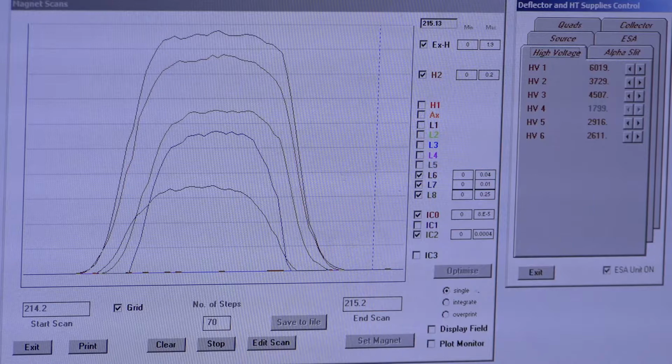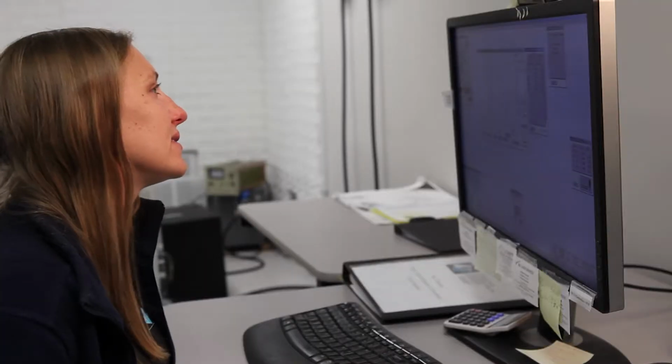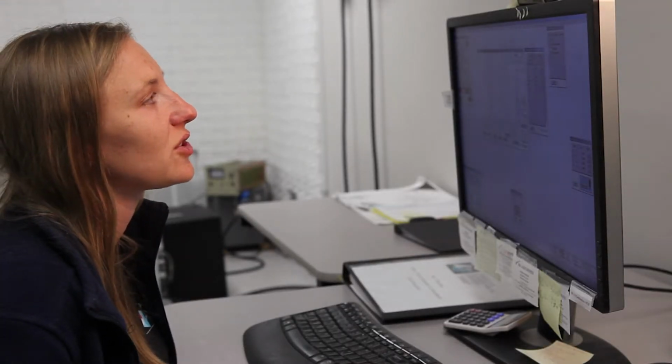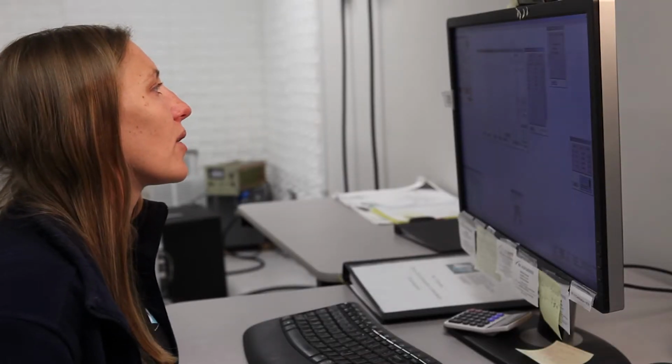Another indication is you've changed a lot of settings and you didn't change anything in the instrument. That usually never happens. Usually big changes in the instrument have big changes on the tune. If no big changes have been made, and it's not an old tune file, you shouldn't be changing quite that much. So always go back to your original and make sure you're not getting too overzealous.